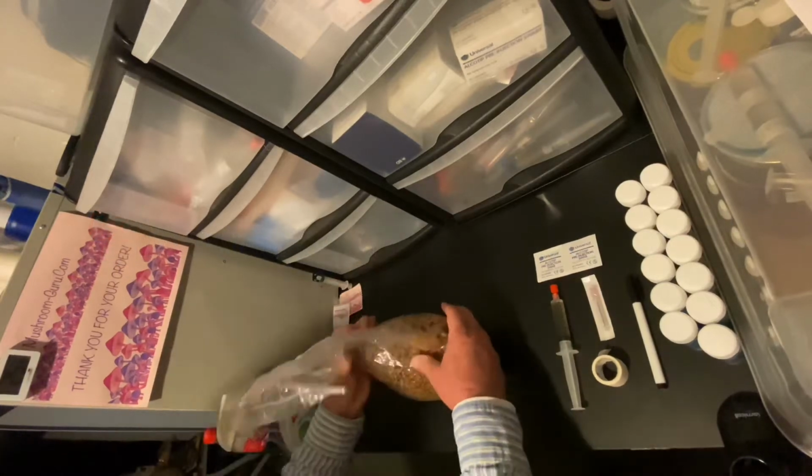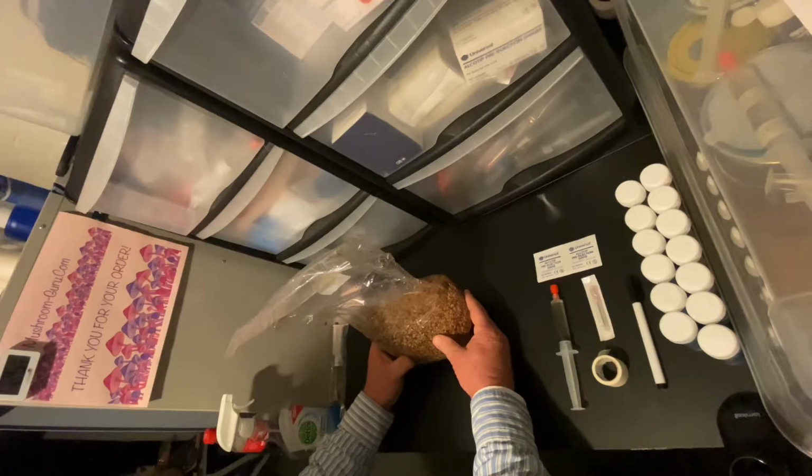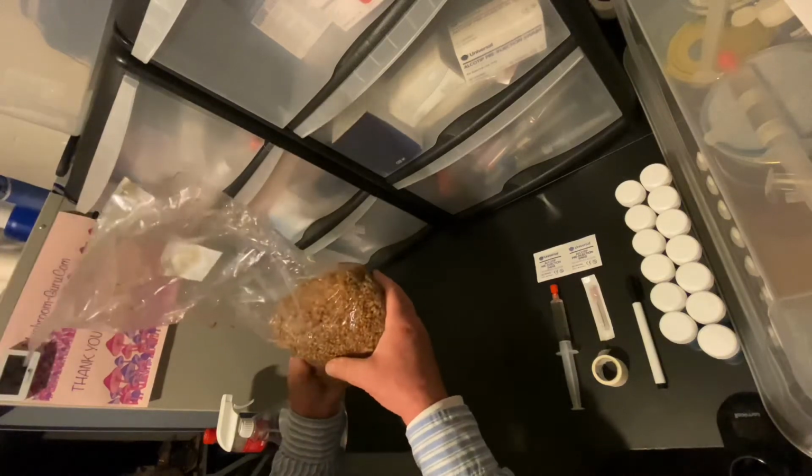Okay, so this was pressure cooked for 2 hours, so sterilized, and I let it cool down overnight, and it's now ready to inoculate.